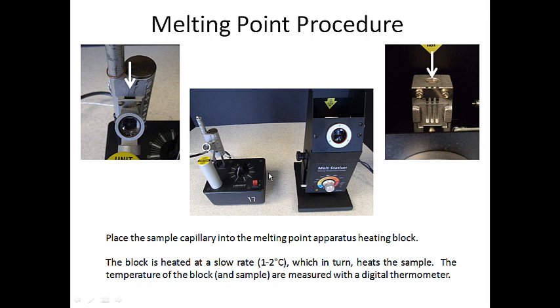Now, I should step back here for a minute and just talk about the differences between these two apparatus in terms of the heating, and also, do you really have to heat between 1 to 2 degrees Celsius per minute? This slide should say per minute.